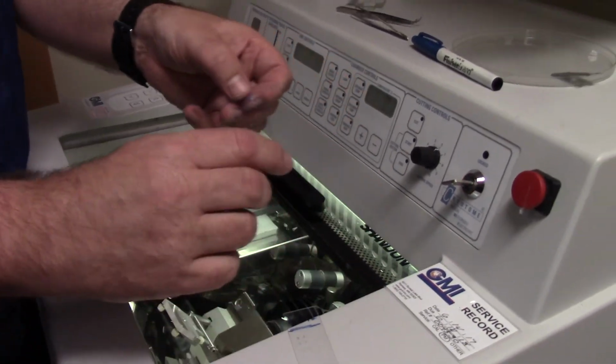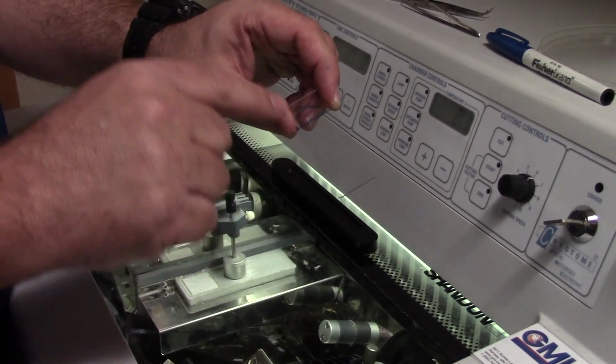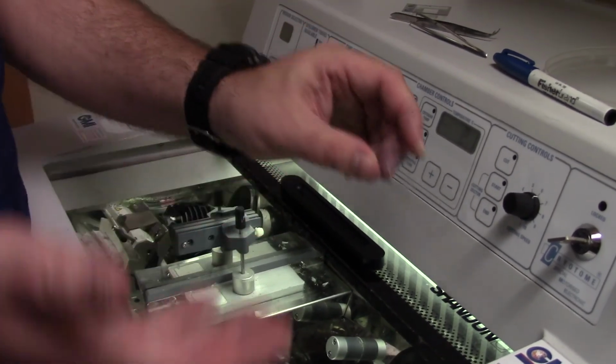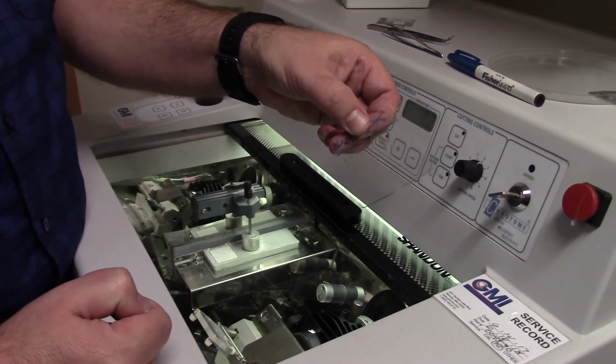Remember that our negative control will have no antibody on it, and therefore we shouldn't see the protein showing up anywhere. Even if it's there, we haven't labeled it. So our negative control versus our positive control will give us an idea of what the background looks like versus what our antibody actually looks like.